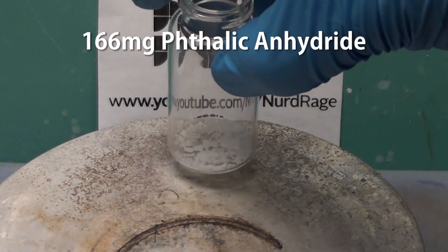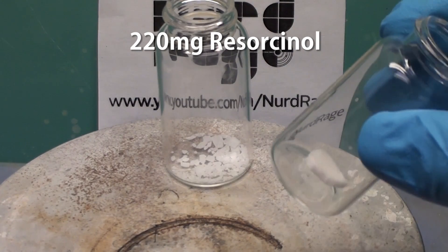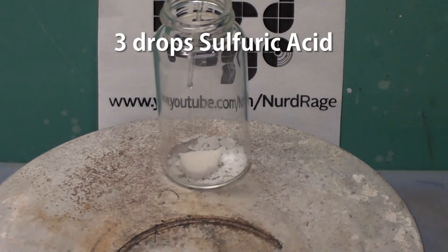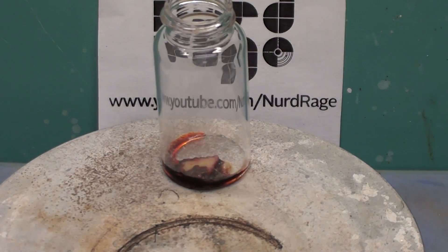First we get 166mg of phthalic anhydride and add to it 220mg of resorcinol. Then we add on top a few drops of sulfuric acid. Now we gently heat the mixture until it turns a dark red-brown.